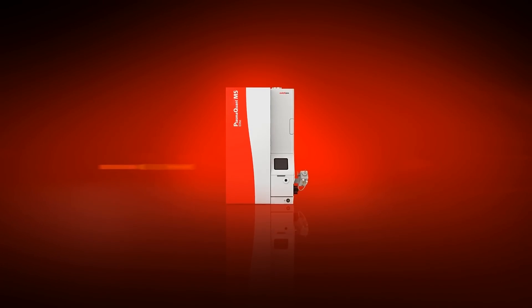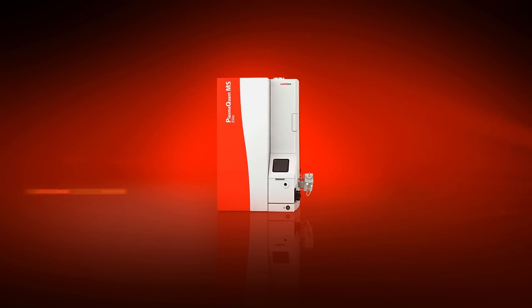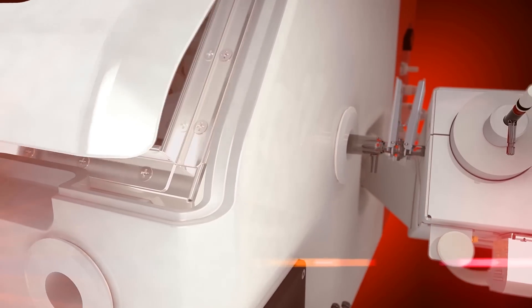Experience the new perspective in ICP-MS with the PlasmaQuant-MS by Analytic Jena.